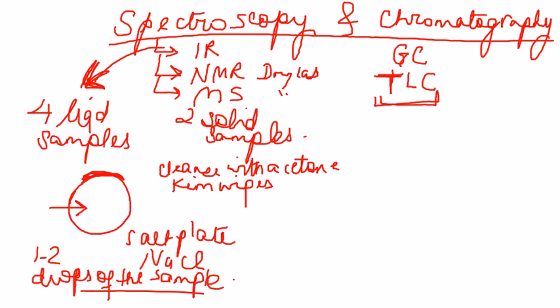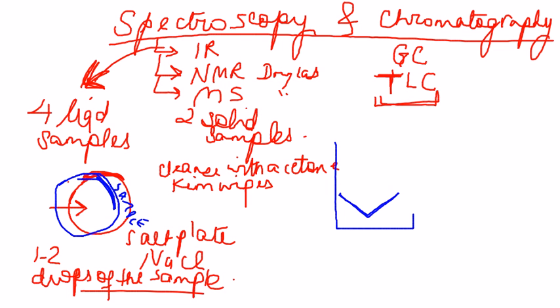And you put the sample, you sandwich it with the other IR plate. So the sample is in between, sandwiched between these two IR plates. You hold it by the edges, and you're going to load it in the IR instrument in that V type of a shape on that black window. That's the path of light, essentially. And again, the lab tech will show you exactly where that spot is.